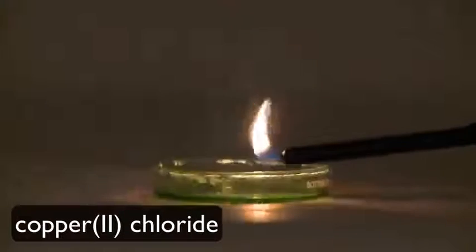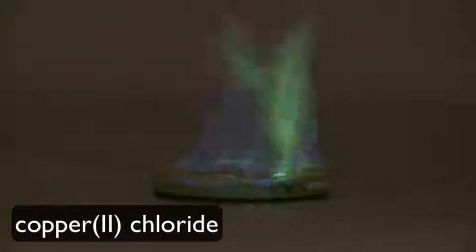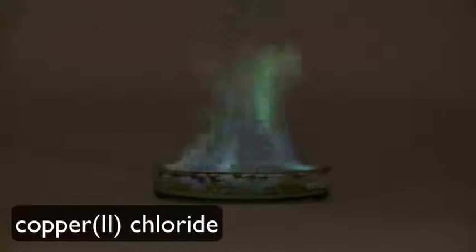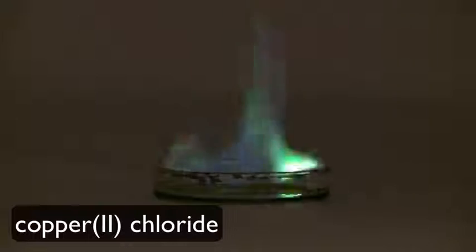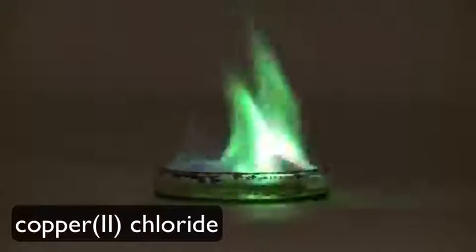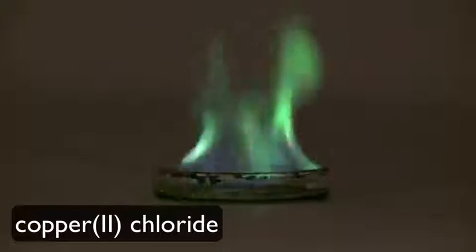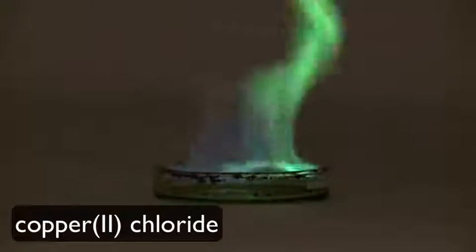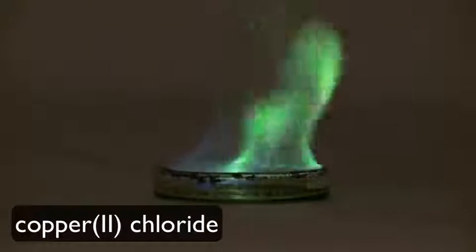The seventh flame test we'll do is for a solution of copper(II) chloride dissolved in methanol. Remember, even though copper is a cation with a +2 charge here, it still has 27 electrons that can be moved into the excited state by the heat of the flame, and those can relax back down to lower energies in transitions. Those transitions emit a bright green light that we can see with our eyes.